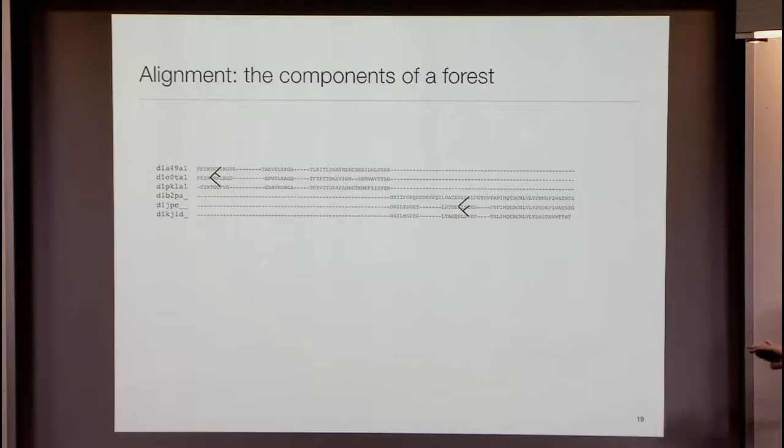So actually, the order in which I put these two sets doesn't matter, right? I could have flipped them around. But within each of them, the order matters, because they're real sequences. So to my knowledge, pretty much with one or two exceptions, there are no software programs in biology that can even output this actual kind of picture, right? Because when you just think of comparing strings directly, this kind of solution almost always has a score of minus infinity, or probability zero. Because you can always maybe shift over something a little bit.